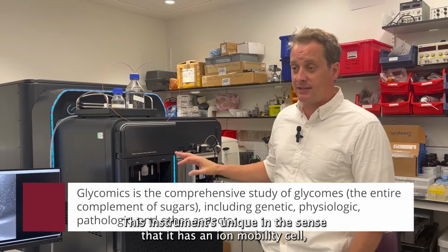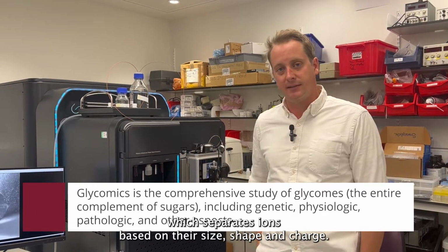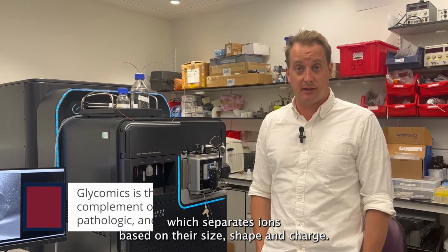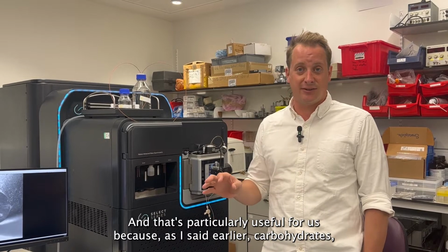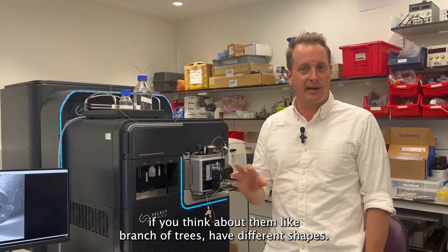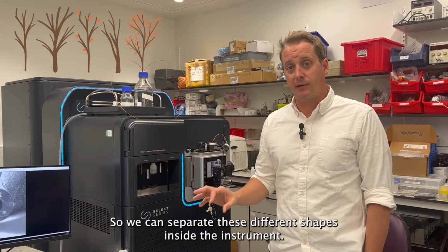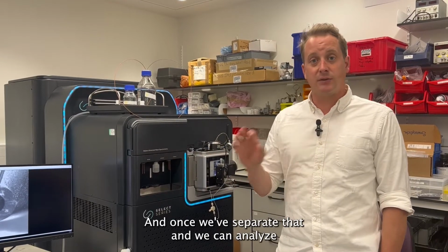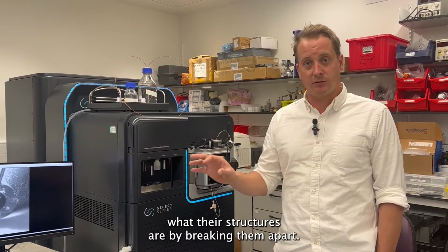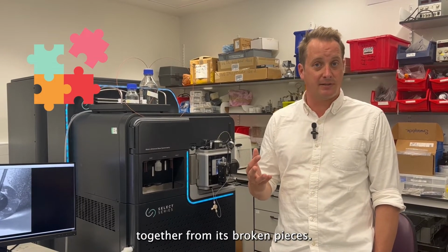This instrument's unique in the sense that it has an ion mobility cell, which separates ions based on their size, shape, and charge. And that's particularly useful for us because, as I said earlier, carbohydrates, if you think about them like branch trees, have different shapes. So we can separate these different shapes inside the instrument, and once we've separated them, we can analyze what their structures are by breaking them apart. So you can kind of think of that as putting a puzzle back together from its broken pieces.